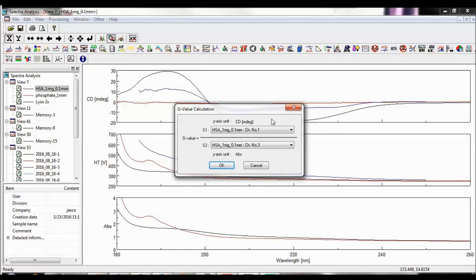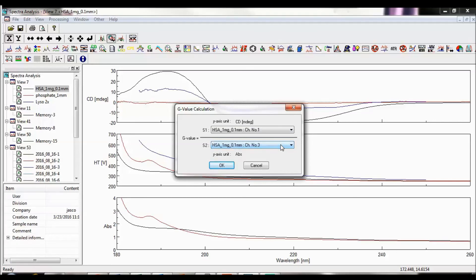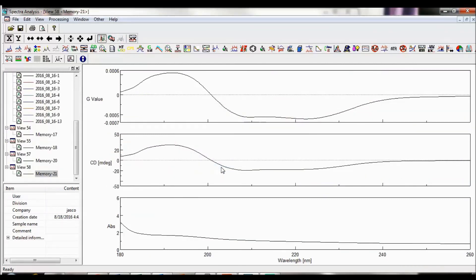S1 is the spectrum used as the numerator for the G value calculation. The desired spectrum and channel can be chosen from the drop-down list. S2 selects the spectrum used for the denominator of the calculation. Selecting OK performs the calculation and creates a new memory.